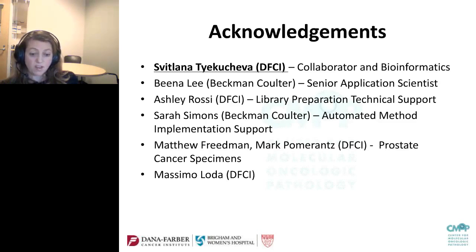I think what we want to disseminate is that we don't have samples from both cohorts that were run on different library prep methods, so we don't have a direct comparison to make, because we wanted to also understand if it's just something we're seeing in terms of the relative degradation of those samples as well. So the idea we have now is to run a small cohort across multiple different library prep methods to compare directly what's happening in those, but we do know that it's a function of the library prep.